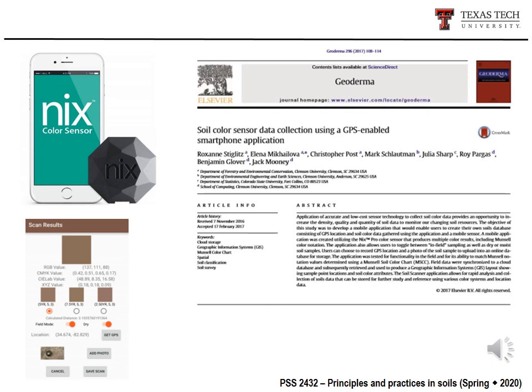This is another paper from 2017 published in Geoderma, again using the Nix color sensor, and now the authors proposed an application for smartphones.